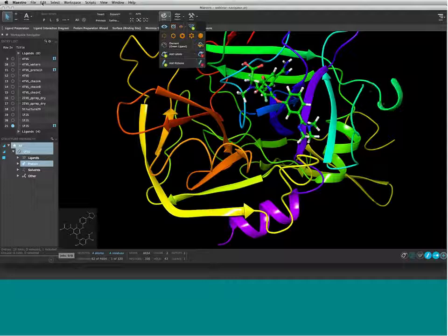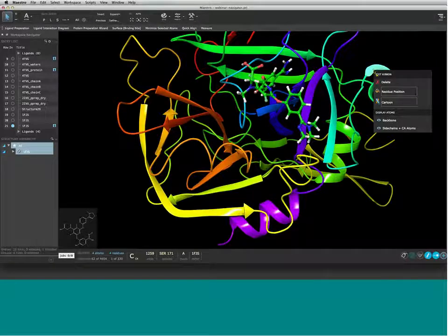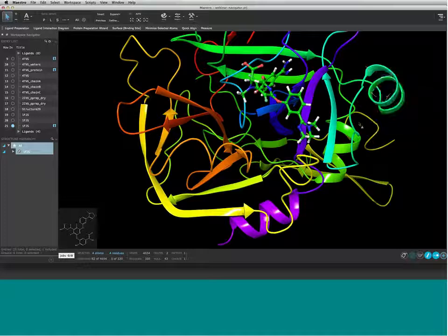I can also choose to display the backbone using the palette, which Robert will be showing you later, and so on. So individual atoms, it's the CA, so it's useful, but it might be more useful to go into residue picking mode, because when you're in residue picking mode, you can actually see the entire residue when you hover. And that gives you a lot of information.